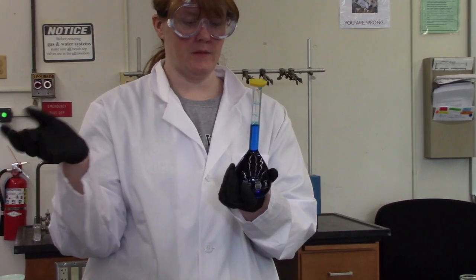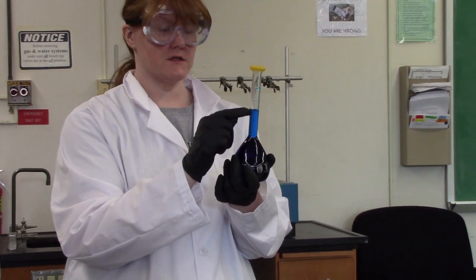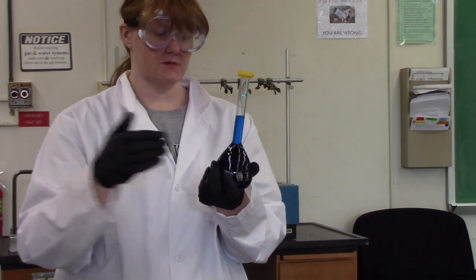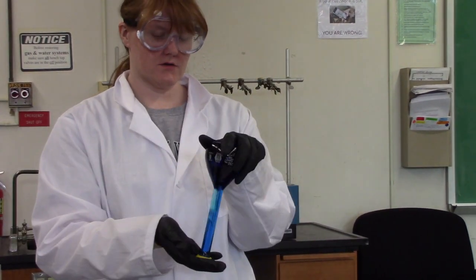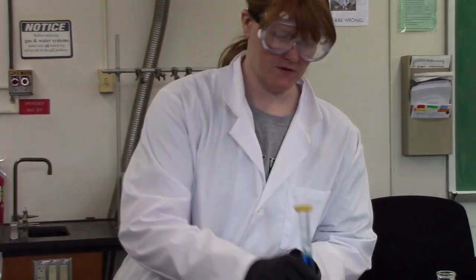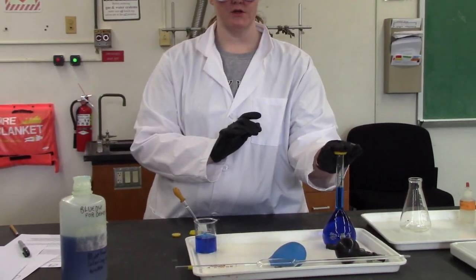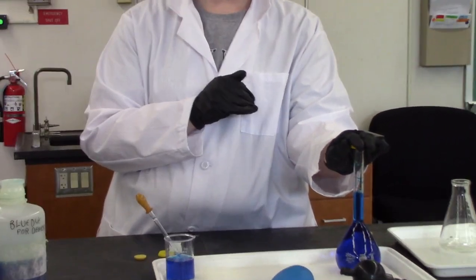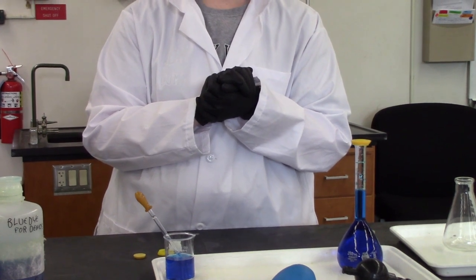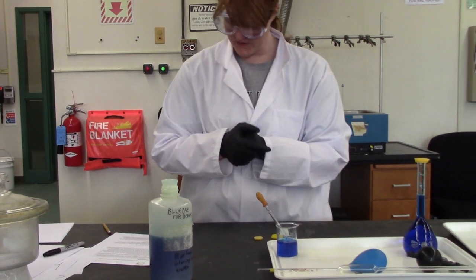If you don't, then what's going to happen is the concentration of your acid at the top is lower than it is at the bottom, and so your titrations in the beginning are going to require a lot less base, and then you're not going to be able to get consistency, which means you're going to have to take more measurements. So taking an extra 2 minutes to mix this properly is really beneficial for you. Okay, so this is your standard solution. You can calculate the concentration to about 4 significant digits because the mass of the oxalic acid was obtained with 4 decimal places. All right, and so that's part one, okay?